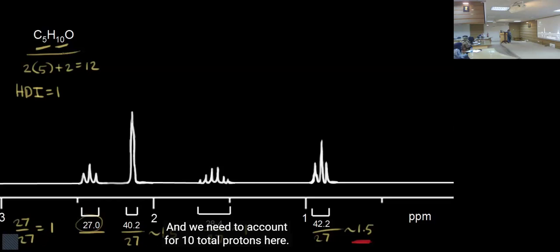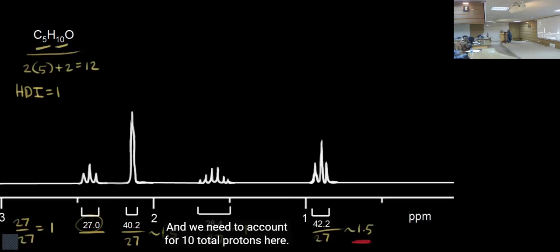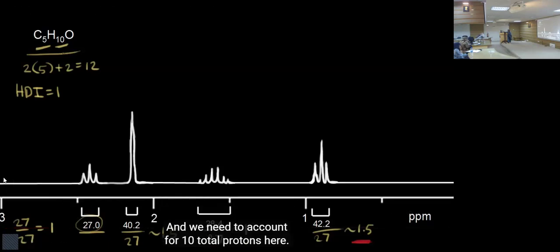You have to first figure out that, most often, about 99.99% of the time, the compound you isolate belongs to one of the classes that have already been reported. So you compare the NMR spectrum with the previous one already reported and find out something new in it, which has not been reported. Maybe a double bond, or maybe some additional functional group. You always have to compare with the literature.